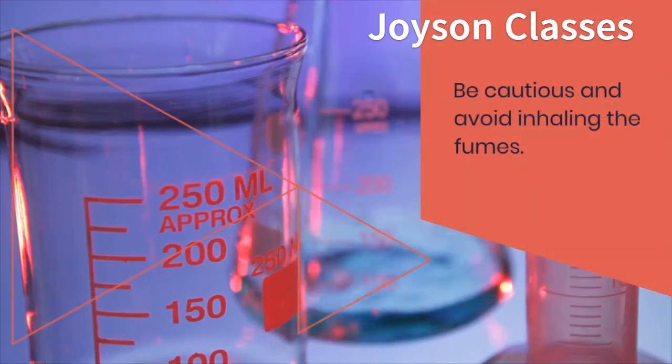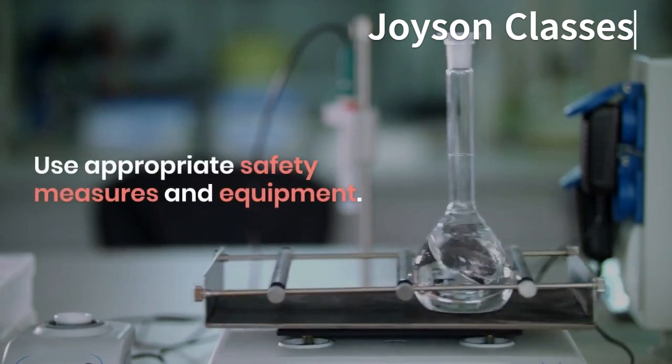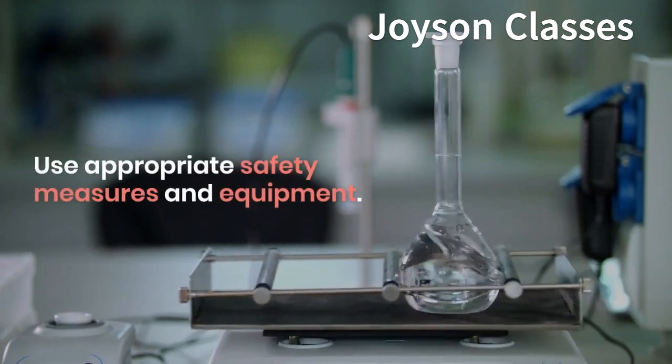Be cautious and avoid inhaling the fumes. Use appropriate safety measures and equipment.